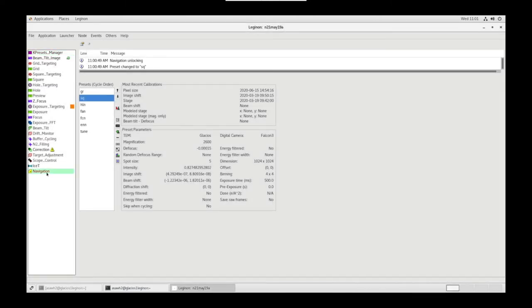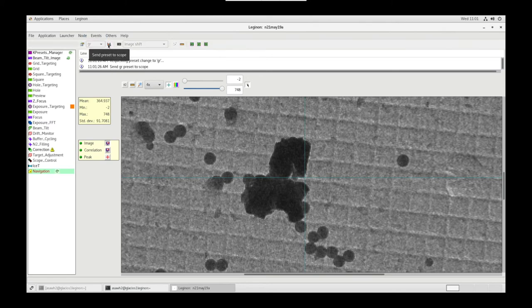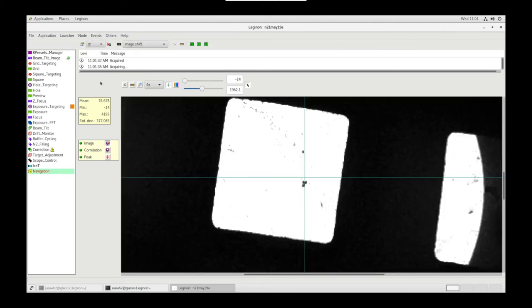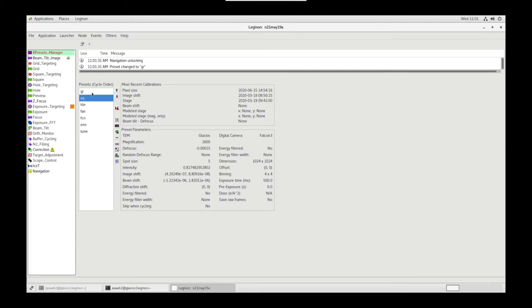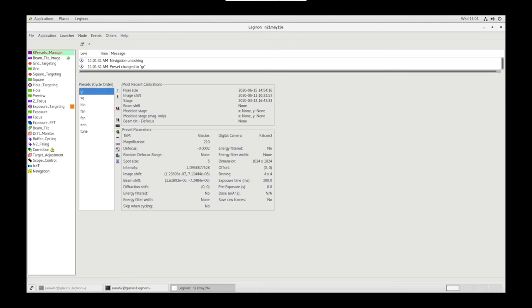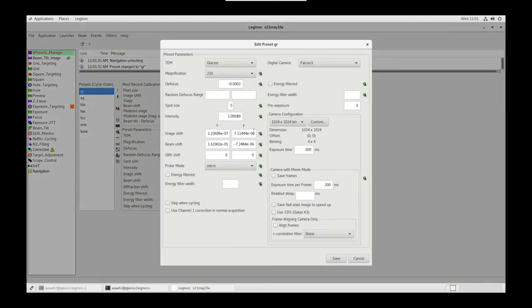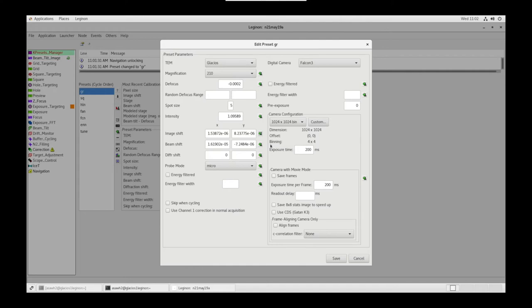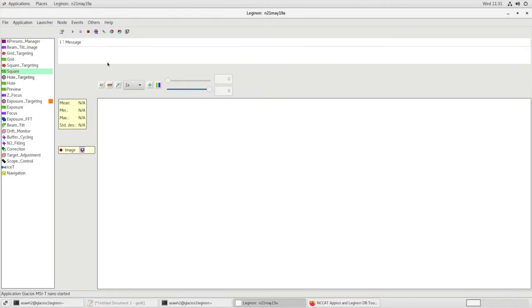Back to Navigation, let's go to Grid, Acquire Image Shift. And this part is a little bit tough, so just try to be over the object. Presets Manager, Settings, import that Image Shift and save. And we're done with Preset Alignments.